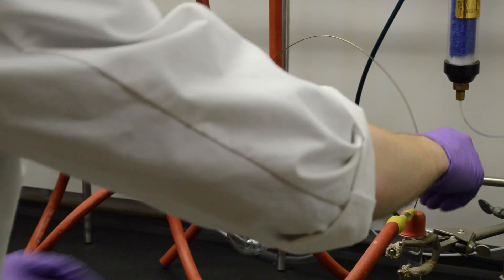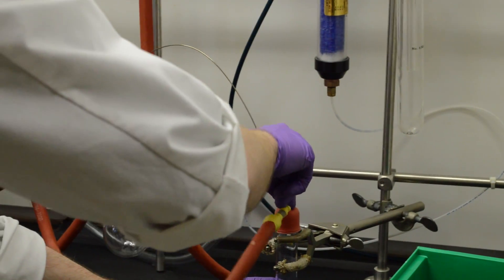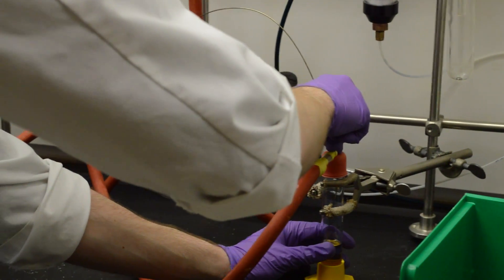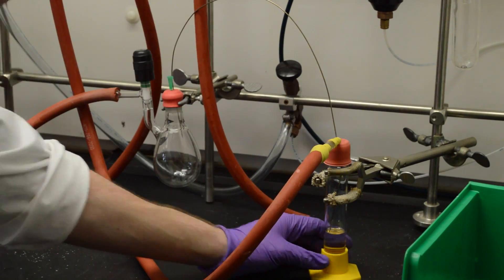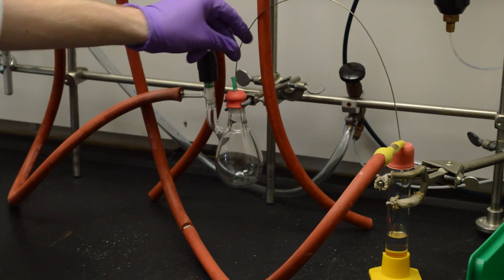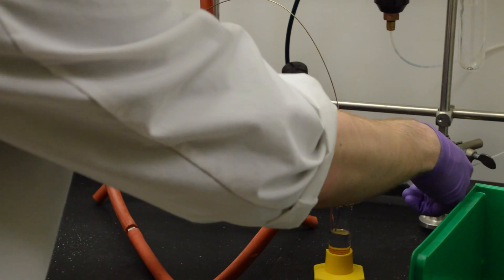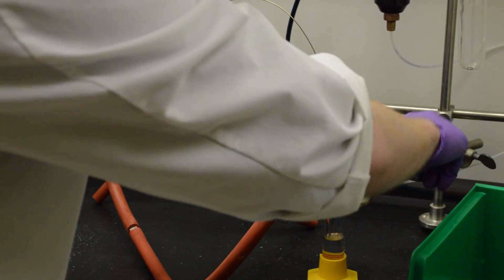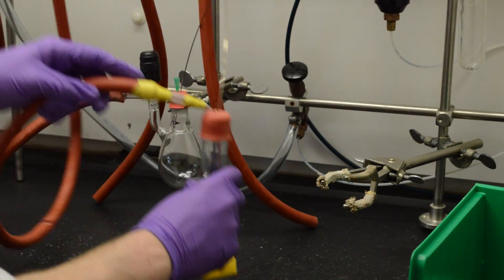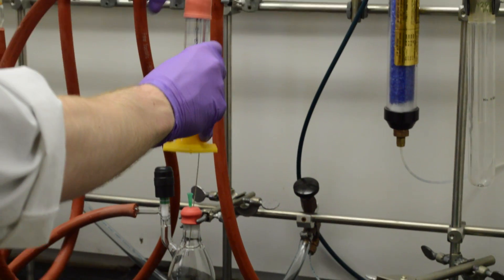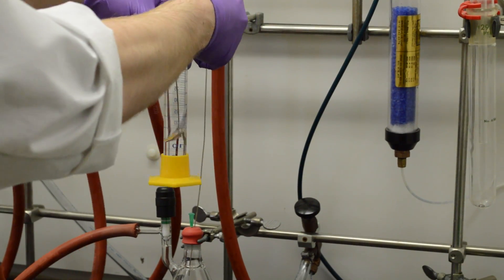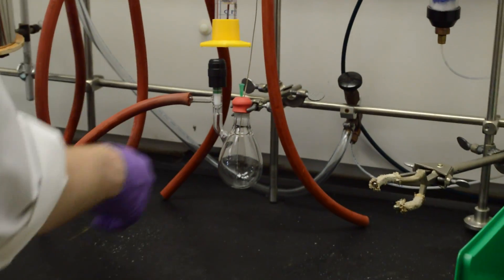So once this is set up, we can slide this end of the cannula down underneath this solution. And a lot of times you won't see this start to pour through right away because the pressure is not particularly strong in these systems. And so if you lift this up, you can actually let gravity sort of help you pour it. And now you can see it coming through into the Schlenk vessel.